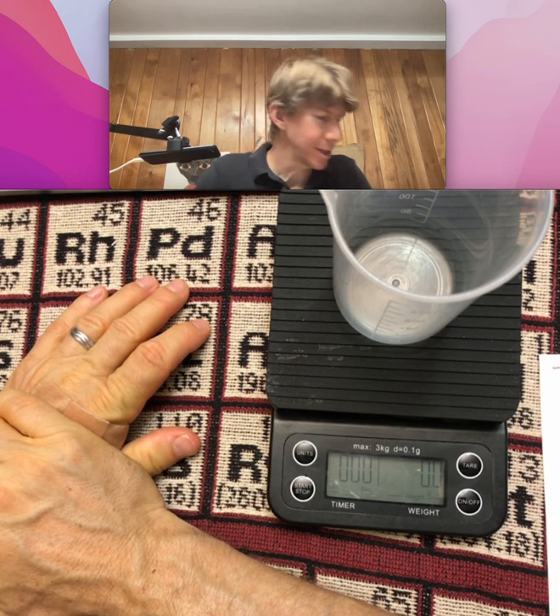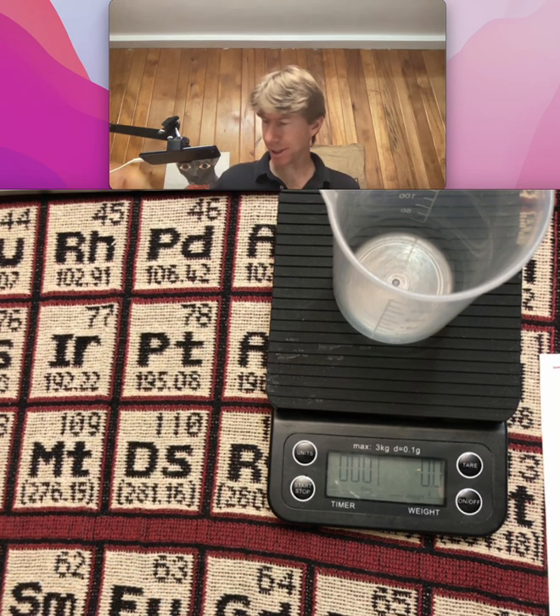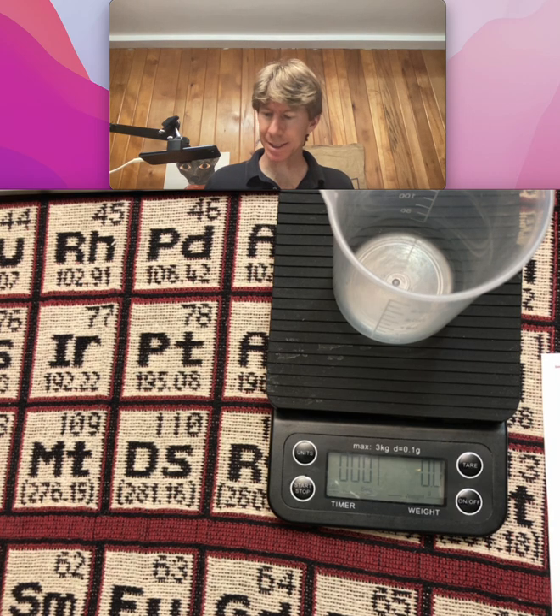Let's get started with Procedure A, mass balances for brewing. I've got my procedure on this side and my data tables on this side.